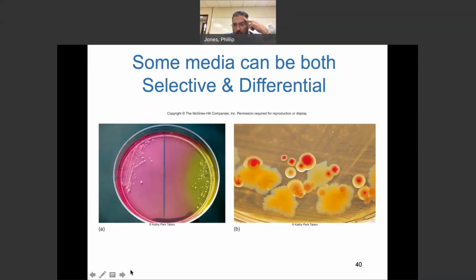Okay. There's what I just showed you, the mannitol. So they swab this. So you divide it in two. This is Staph aureus because it changed the plate. Staph because it's mannitol growing here. Changed the plate from pink to yellow. This is Staph epidermidis. Number one, this colony is white. These are yellow. I can tell by the mannitol consumption what's going on.